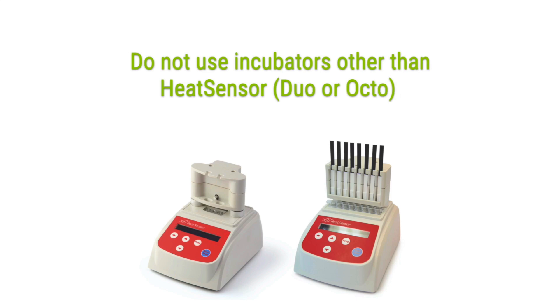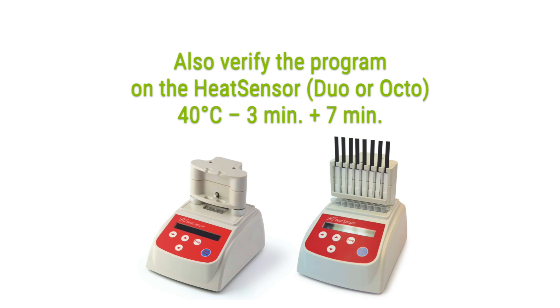Do not use incubators other than the heat sensor. Turn on the heat sensor and select the program AF1, set at the correct temperature and timing. Wait until the temperature has stabilized at 40 degrees Celsius.